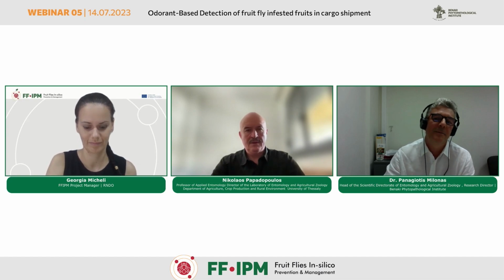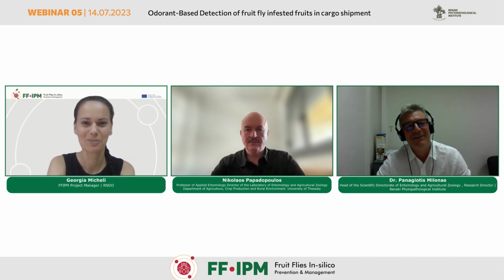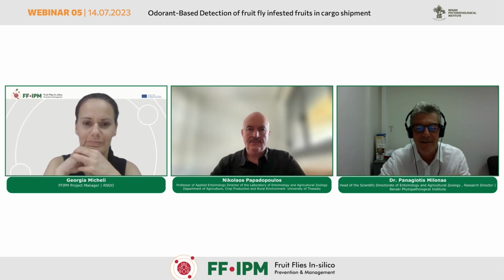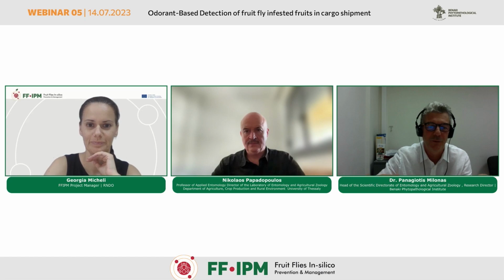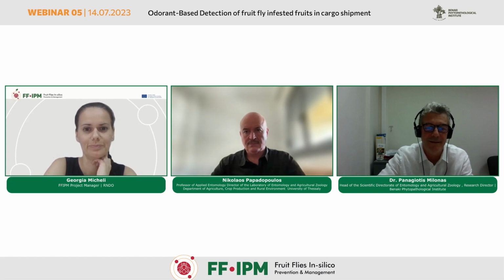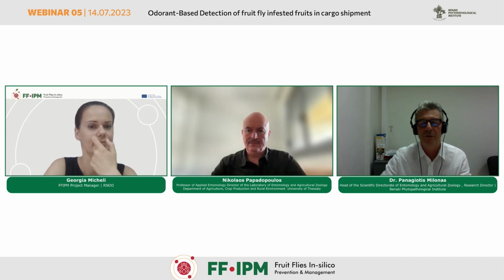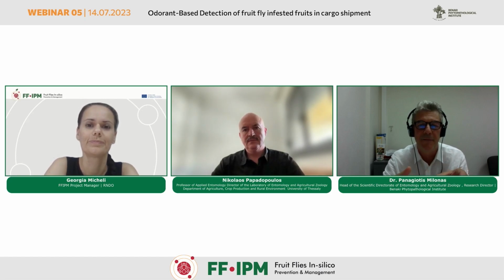You know, I didn't say that. I thought it could be a question. When you are using the electronic nose, we use these bags to pack. And in practice, what we will do now is we will go and we will wrap a carton with fruits, and we will take the volatile samples from that wrapped carton. And this would be actually the procedure in place if it ever goes to the real world. For the inspector to take a carton of fruits, wrap it with something like we did, and then take the air sample from there and see if it's positive or not.